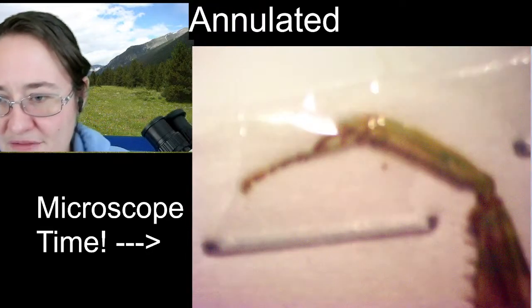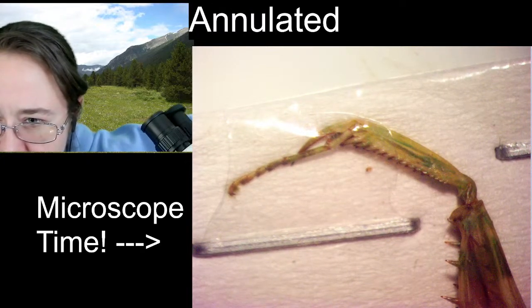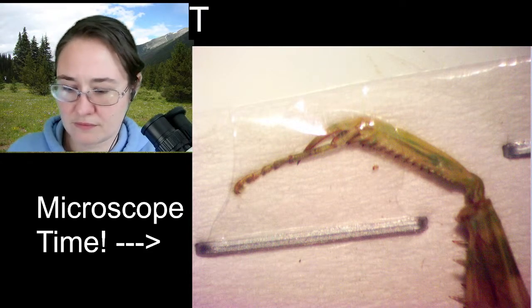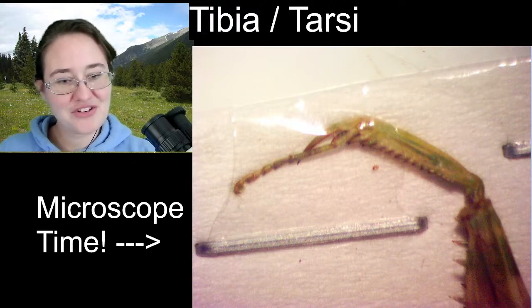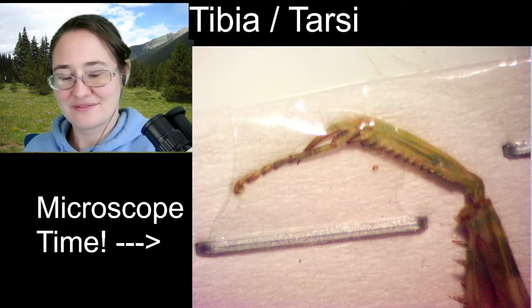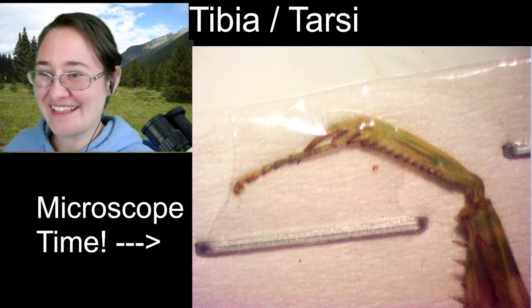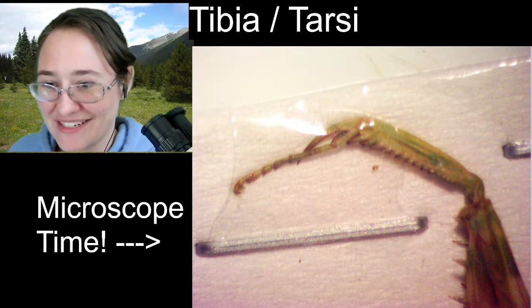All right, now we have the tibia and the tarsal segments. Annulus is a sort of ring shape. Cool. Yeah, I beat you to it, but that's all right. I love that we're on the same train of thought.